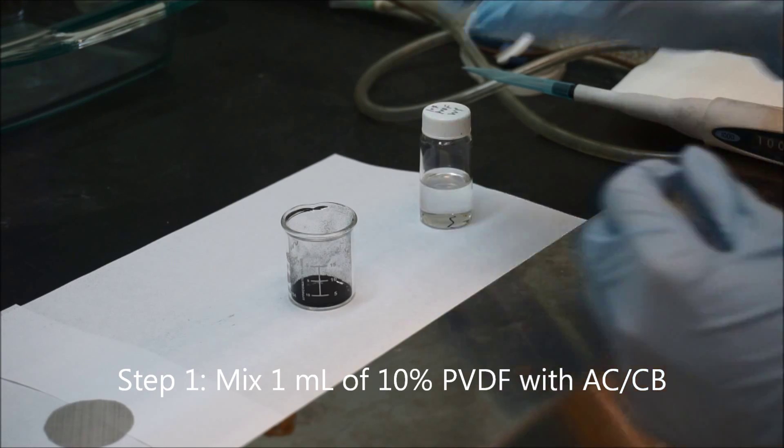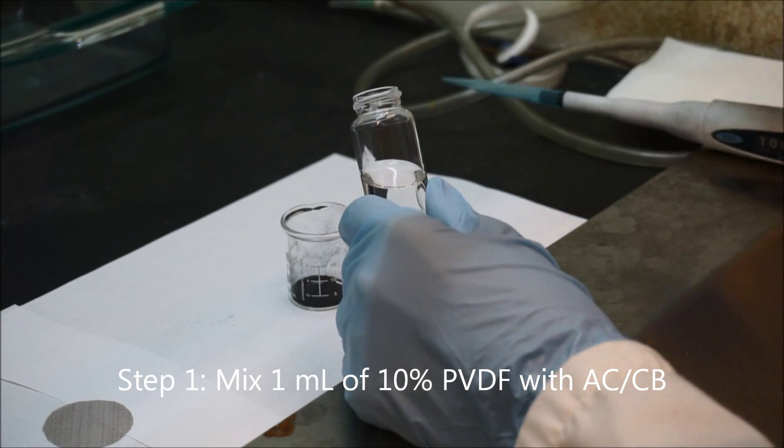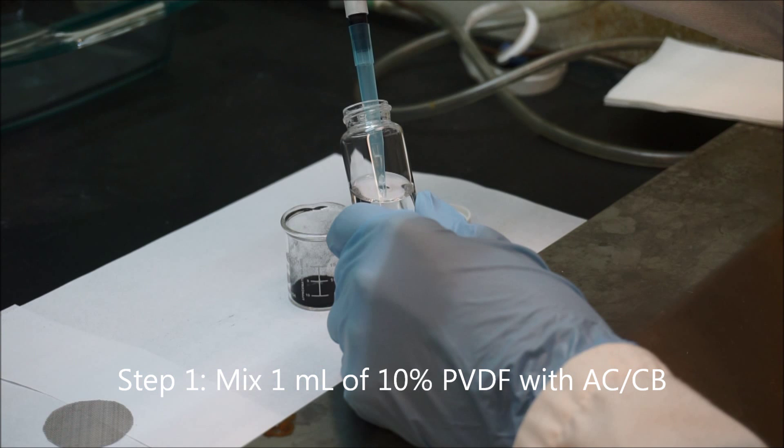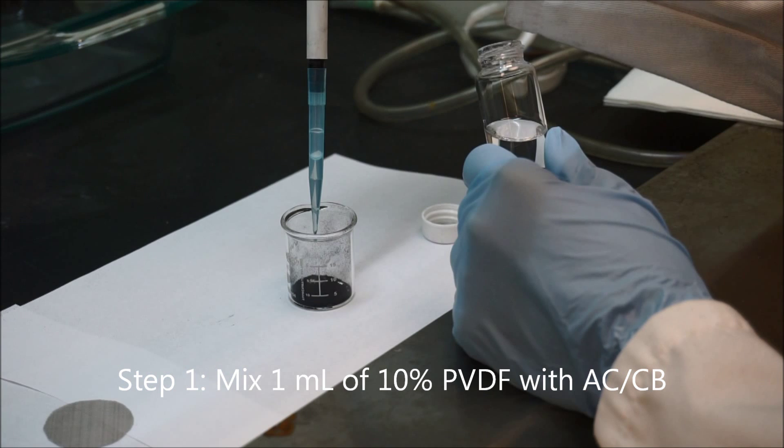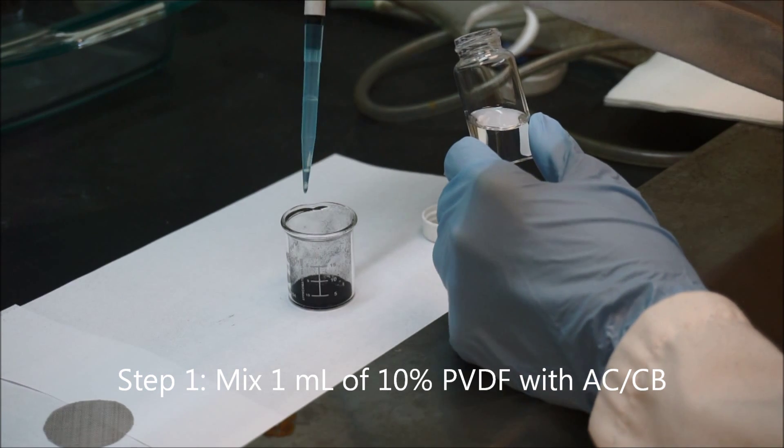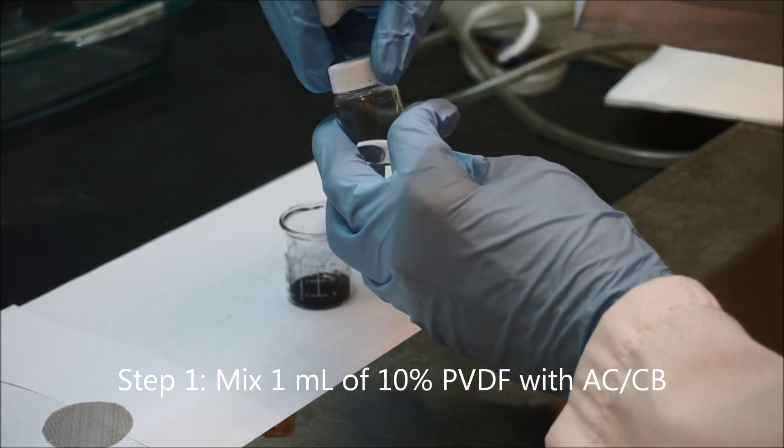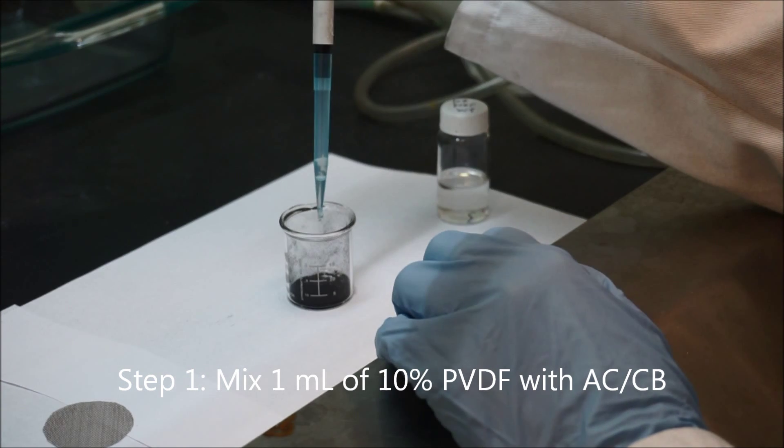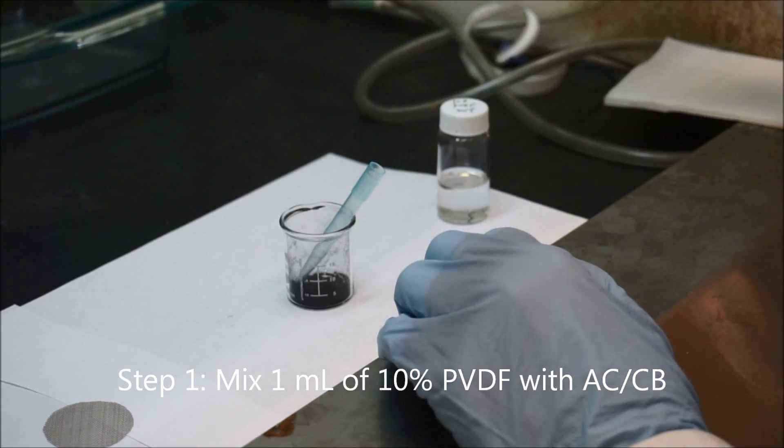So the first step is to mix the PVDF solution with the active carbon and carbon black mixture. We use a pipette to get out one milliliter of the PVDF solution and then fill the solution into the beaker. The solvent is a bit toxic so remember to cap the bottle after you take out the solution. Then use the pipette to mix the carbon powder with the PVDF solution.